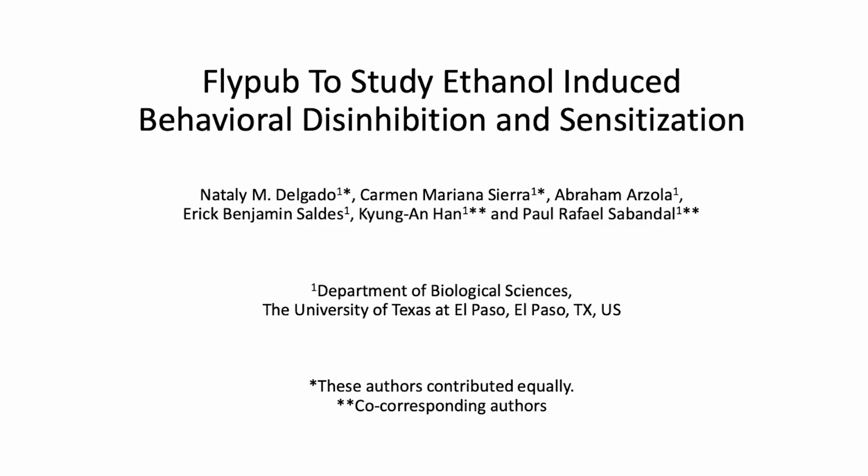The Flypub assay measures disinhibited behaviors under the influence of alcohol, thereby facilitating the mechanistic study of alcohol use disorder. Alcohol is one of the most readily available and widely abused drugs in the world. The neurobiological mechanism underlying alcohol use disorder, however, is incompletely understood.